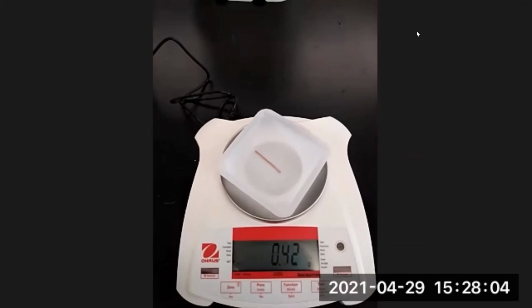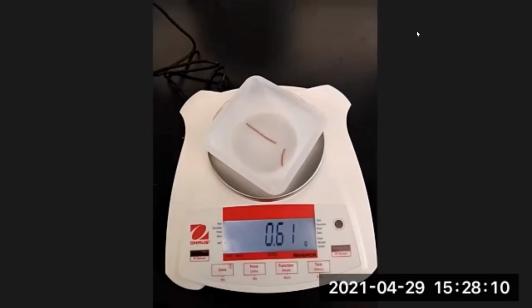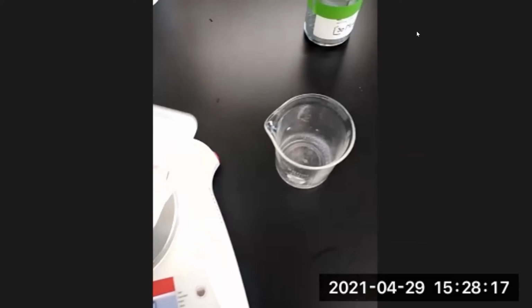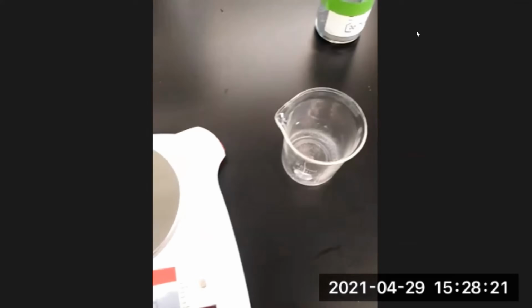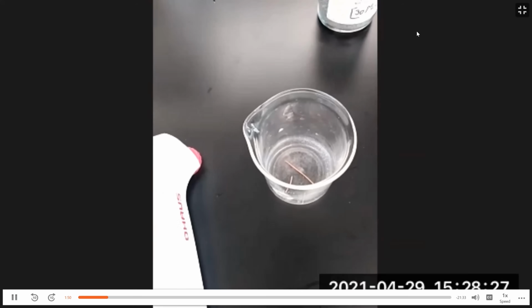You can use wire cutters to cut the copper into small pieces. The smaller the pieces, the easier it is for them to react with the nitric acid. It works a little bit better when you have smaller pieces. And then we're going to add the copper to the beaker and go to the hood and add the 16 molar concentrated acid.